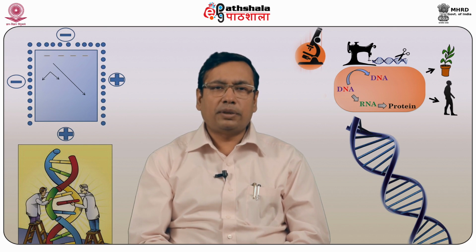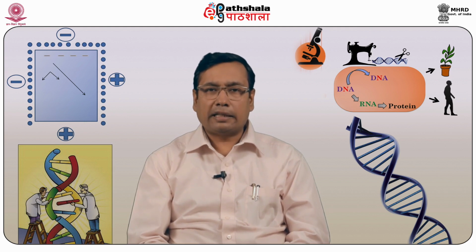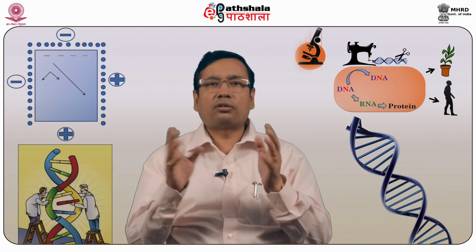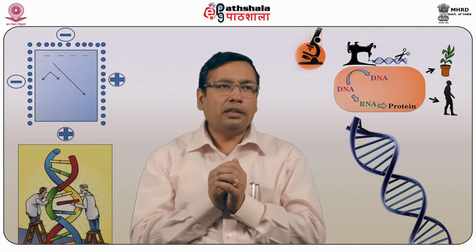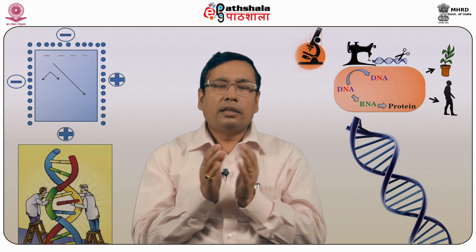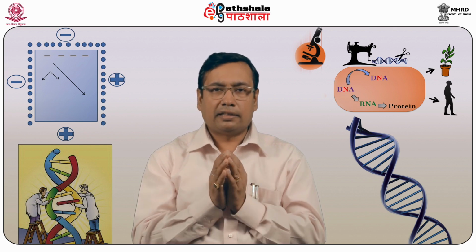The procedure of PCR typically consists of several cycles, such as from 20 cycles to 40 cycles, with repetitive change in the temperature, and this repetitive change is called a cycle. Each cycle commonly consists of 2 to 3 discrete temperature steps, and finally we do the PCR with 30 or 40 cycles.